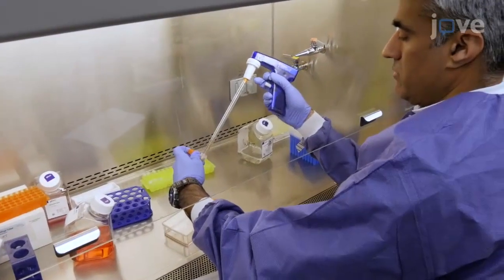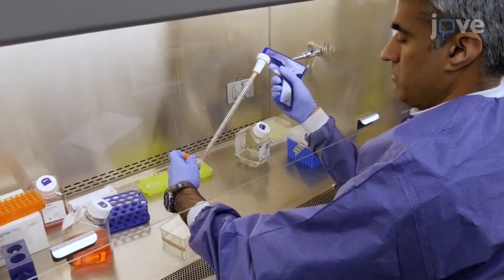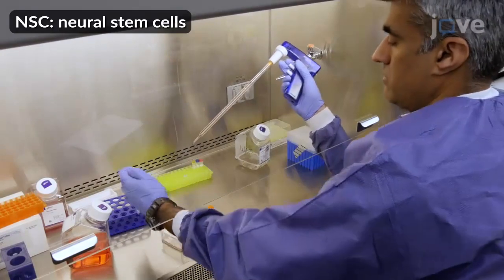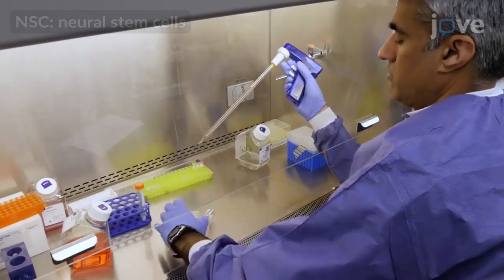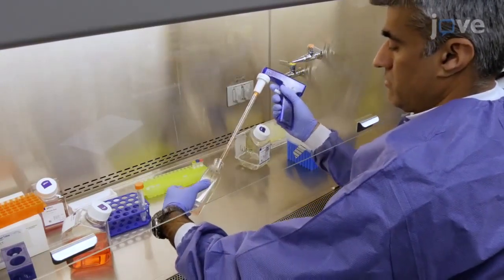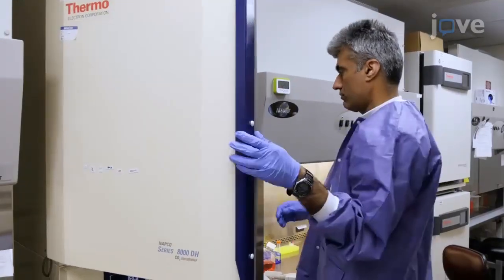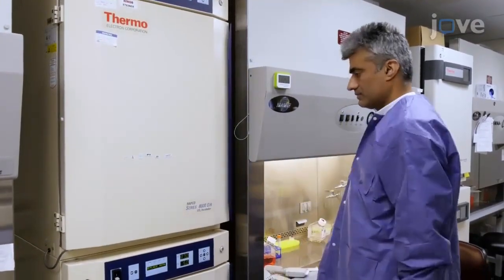First, in a biological safety cabinet, culture cells in a T75 flask with NSC medium so that they will be at least 80% confluent when beginning the assay. And place the flask in a cell culture incubator set at 37 degrees Celsius and 5% carbon dioxide.